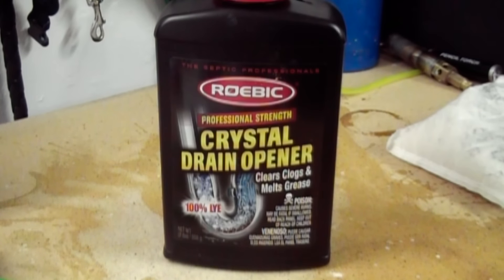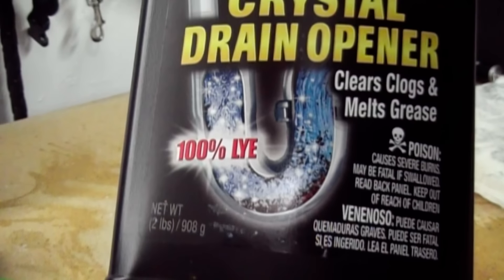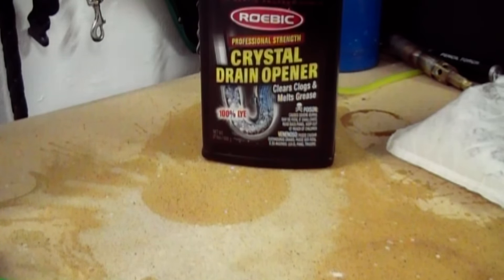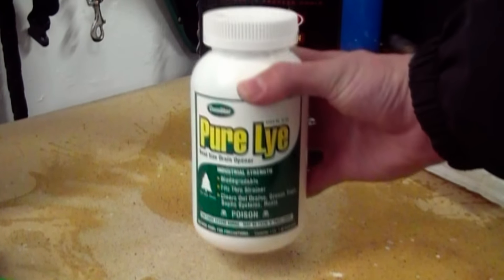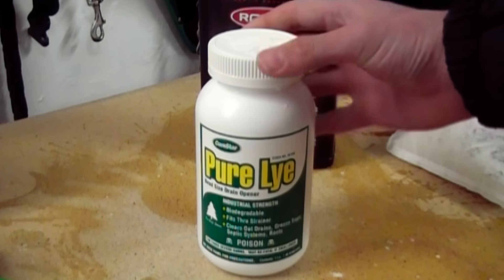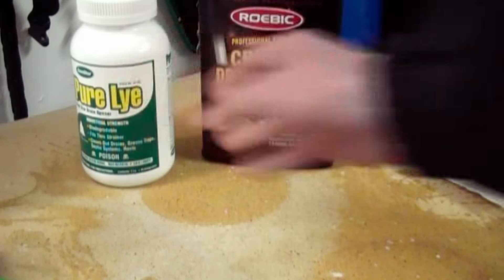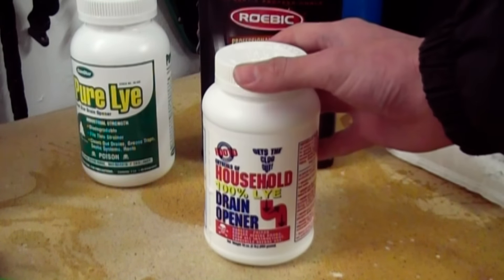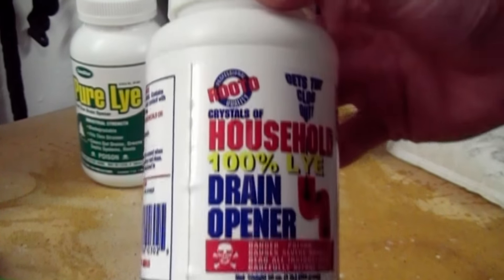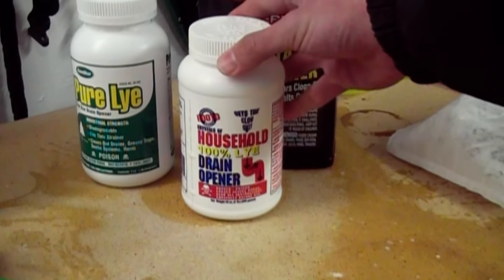To start out with, you need 100% sodium hydroxide. This can be found as this crystal drain opener, and this particular bottle was bought at Lowell's. This bottle was purchased at Big R, and it will also work as it is pure sodium hydroxide. This bottle was purchased at Ace Hardware, and again you can see that it's 100% lye, or sodium hydroxide.